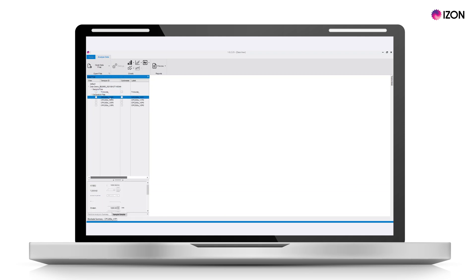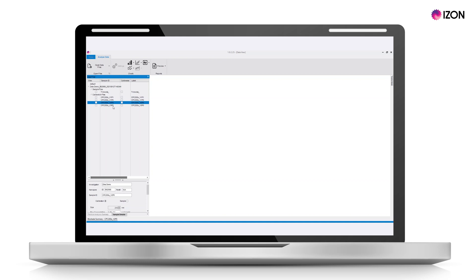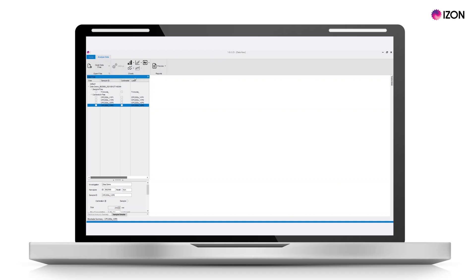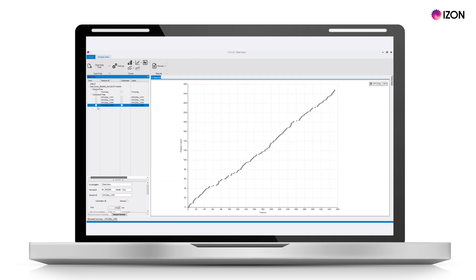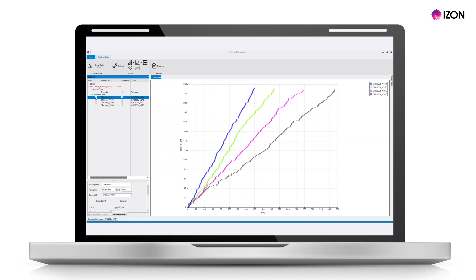Once your data files are processed, check that there are four calibration files labeled V1P1, V1P0, V2P0, and V3P0. Select the rate plot option from the dynamic plots menu and plot all four calibration files. The particle rates of the calibrations should decrease from V1P1 having the highest rate and V3P0 having the lowest rate, as shown here.